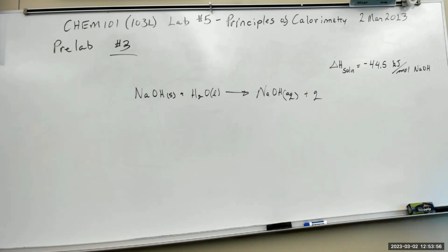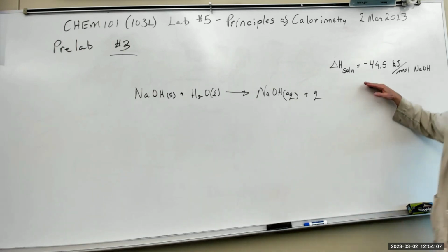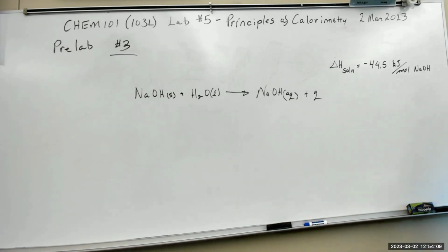If you did it the other way, with the acid already there and you add a little bit of water to it, it goes the other way. The same thing happens with bases. Bases and acids going into solution generate a lot of heat.